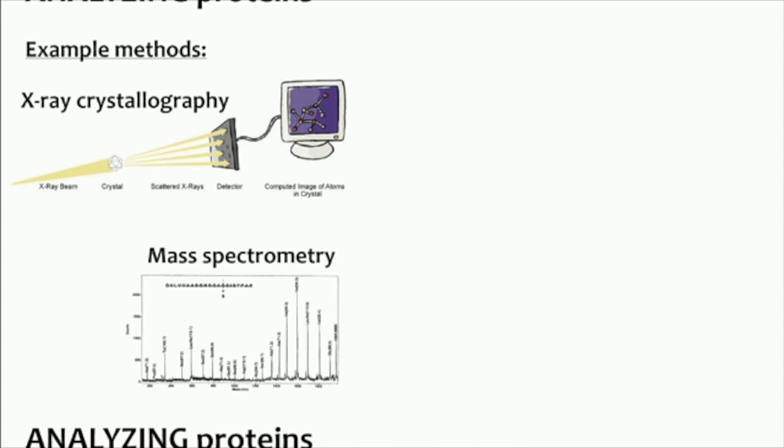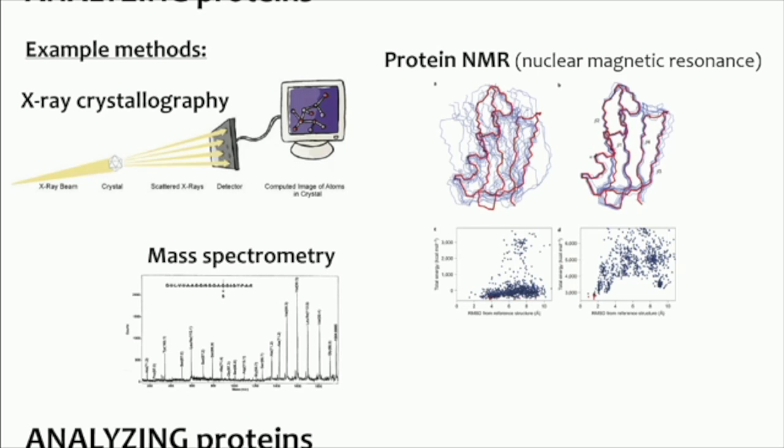Another way that's even more complicated is protein NMR. I know we have an NMR here, in the chemistry department. I don't know if anybody's used it. We don't do proteins with it because that's also very complicated. But that's another way of determining protein structure. It's a little bit tricky because if there's any kind of change in conformation of the protein over time, it can be hard to see that. But it's another way of determining the overall 3D structure of a protein.